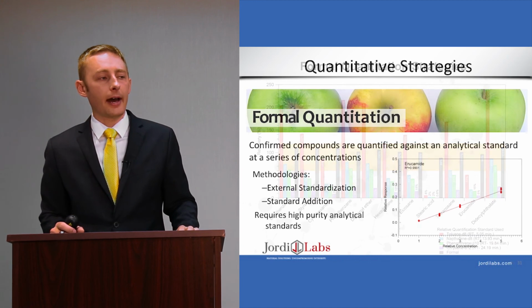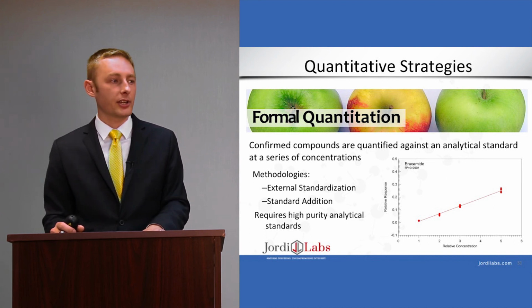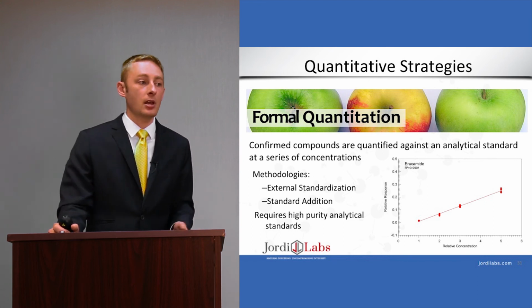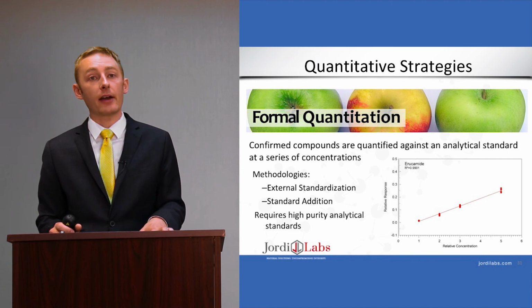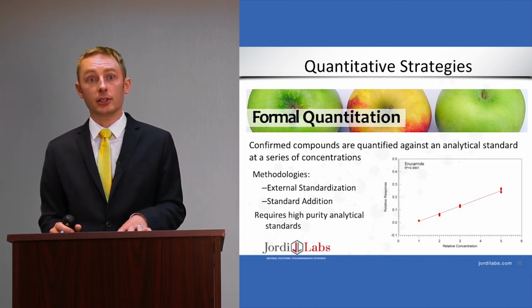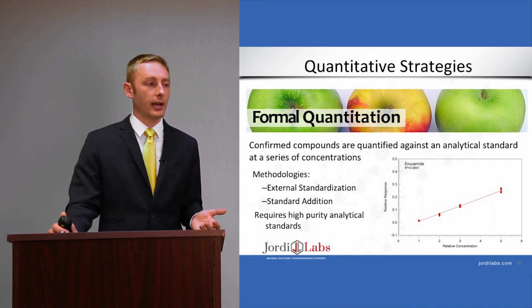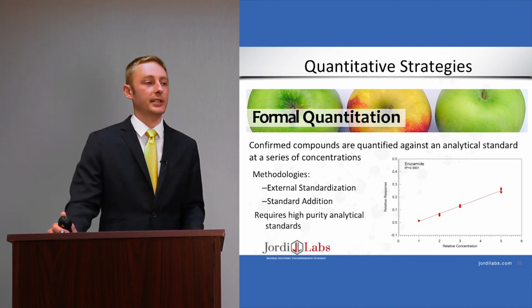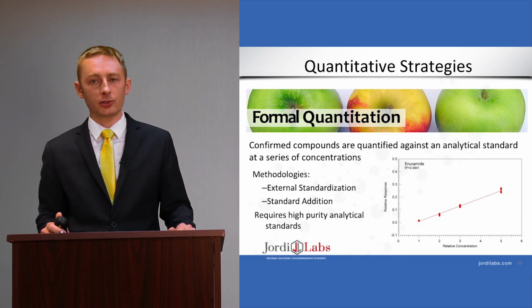And so the different strategies that we use for this sort of quantitation work, it may use an external standard, it may use standard addition. There are some drawbacks to formal quantitation where you absolutely have to have a commercially available high purity analytical standard to construct your calibration curve for this. And so there are trade-offs for each one of these sort of quantitation strategies. In all cases, we prefer to do formal quantitation. However, in some cases, it's not necessarily appropriate, depending on the analytical strategy you're looking for.